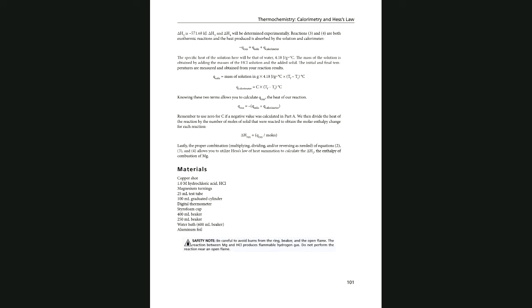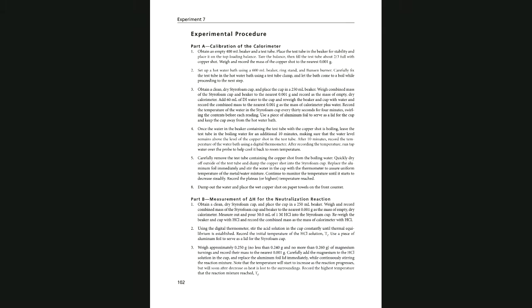We are going to calibrate the calorimeter to find the heat capacity first. That's part A of the experiment.